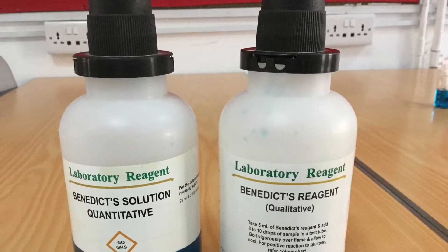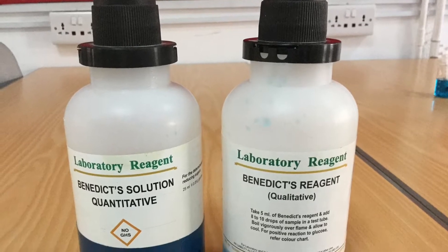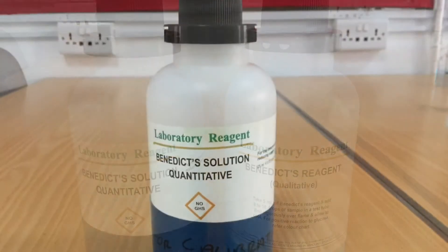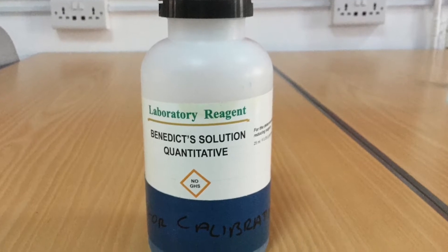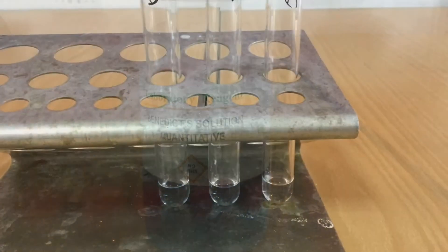In this experiment we're using quantitative Benedict's to produce a calibration curve and to find the concentration of glucose in three unknown urine samples.